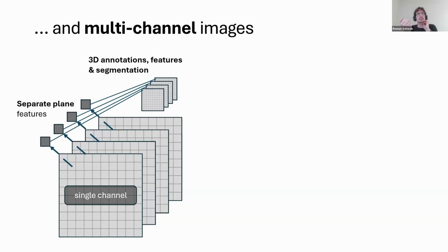For the 3D image, this could also be 3D as in time series, you're extracting features for each separate plane. So you can say each plane is like a separate image.